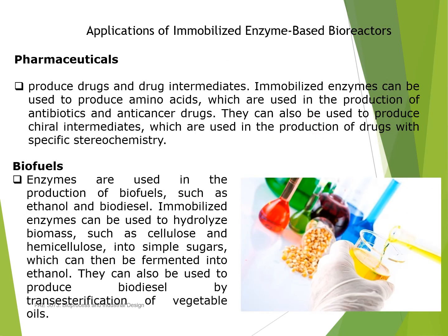Okay. Number two, in the pharmaceutical industry, in order to produce amino acid, immobilized enzyme is used inside the bioreactor, so it will produce lots of amino acid which are used in the production of antibiotic and also anti-cancer drug.